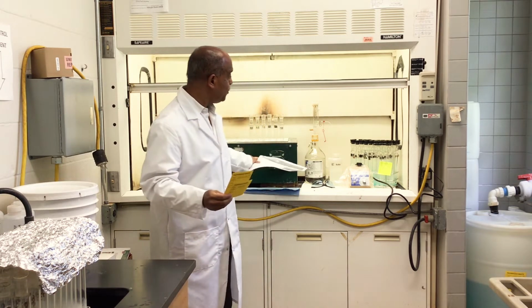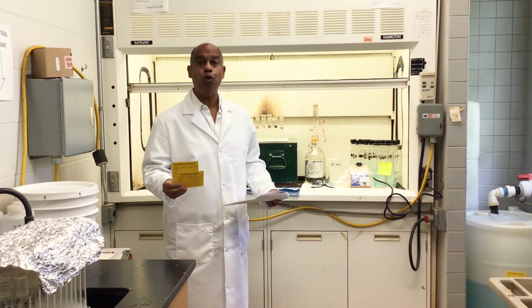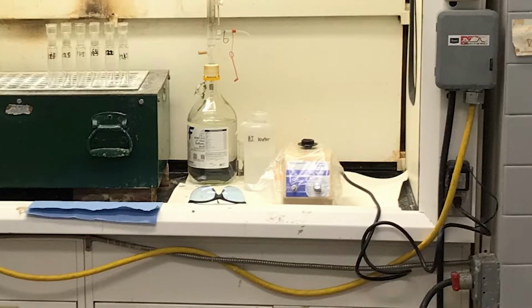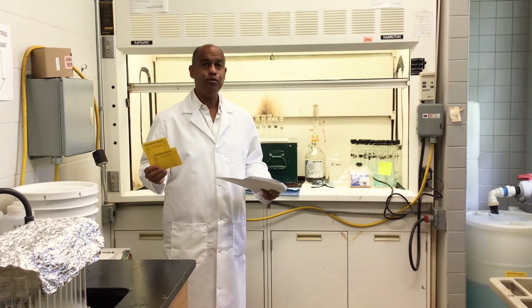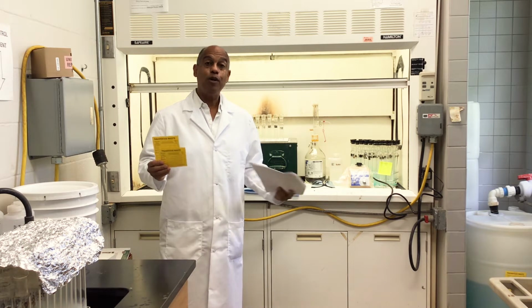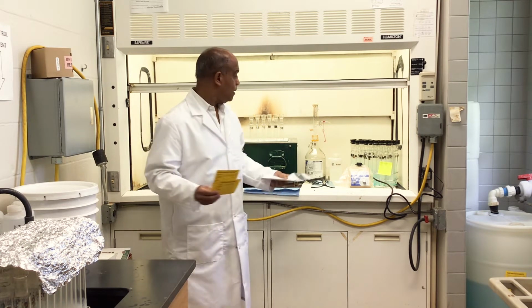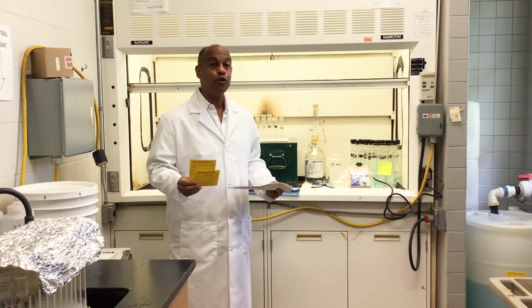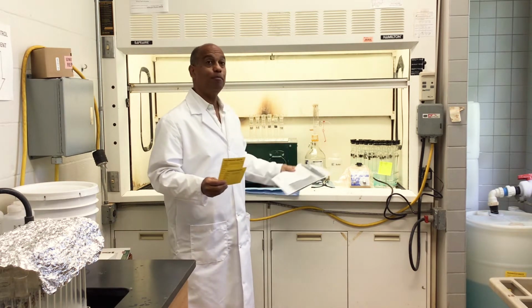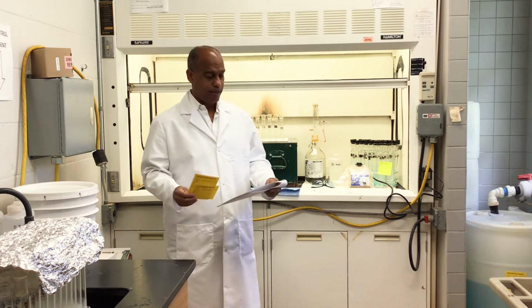In the back of the fume hood here, we have two bottles. One bottle of deionized water and the other one of pure sulfuric acid. They're both clear liquids with no labels. They just would look the same, but one will burn you and the other one is inoffensive. We did not put a label on the water bottle, but it's written with a marker. So you have to be able to identify things.